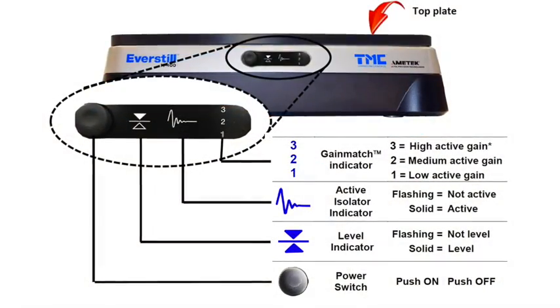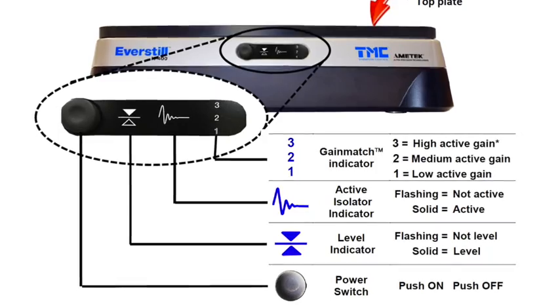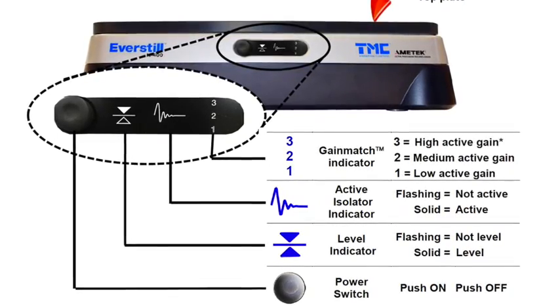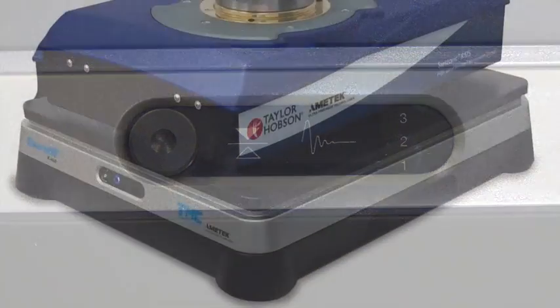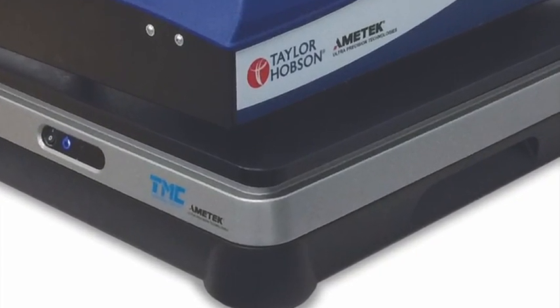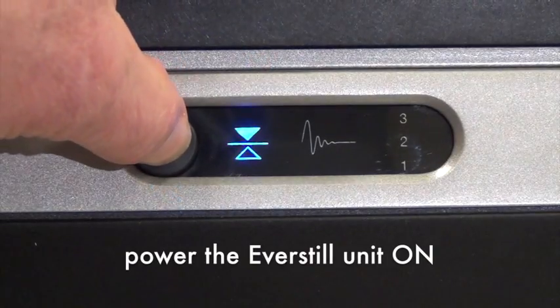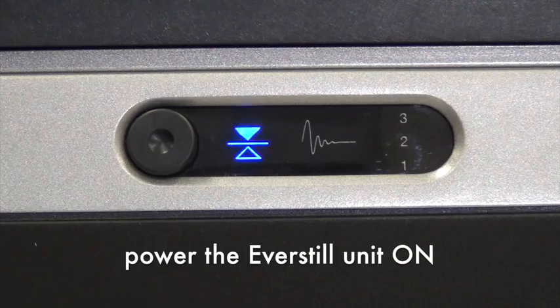The front panel includes the power button as well as the indicators for the level of the top plate, active isolation, and gain-match. Ensure the power is off. Place, center, and level the equipment payload on the top plate. Press the power switch on when no external transient events are expected for three to five minutes.